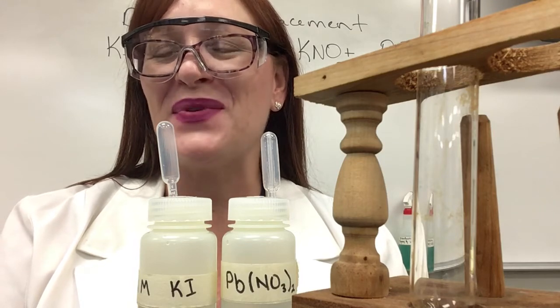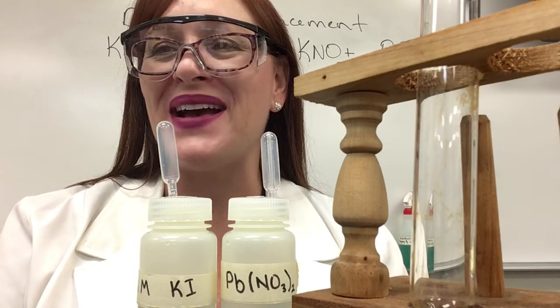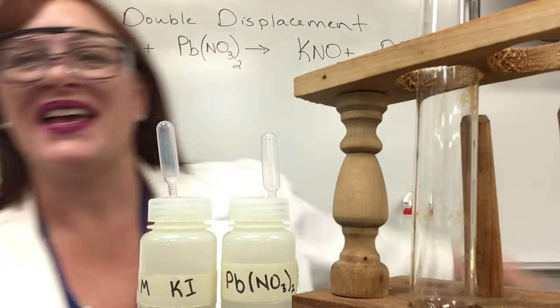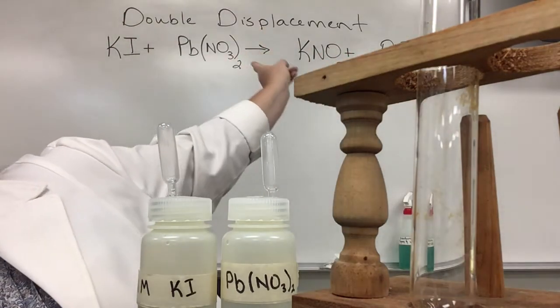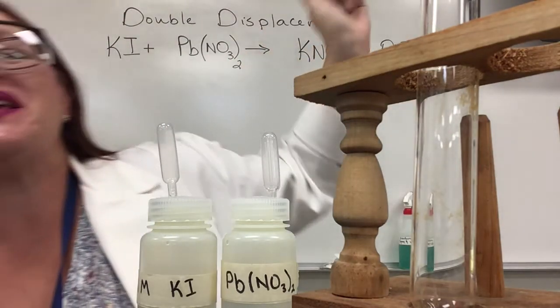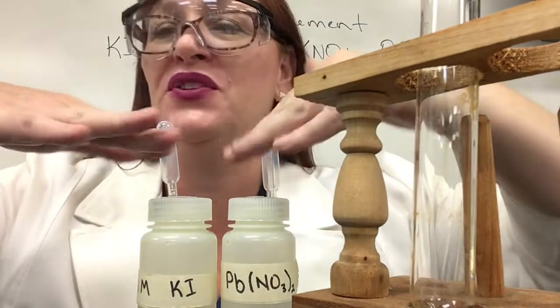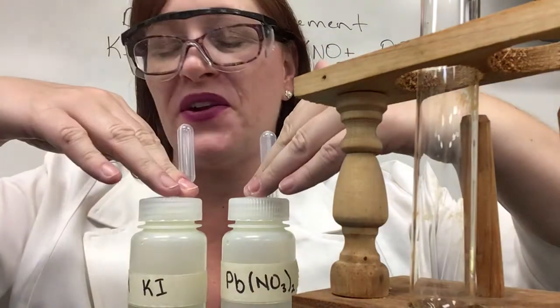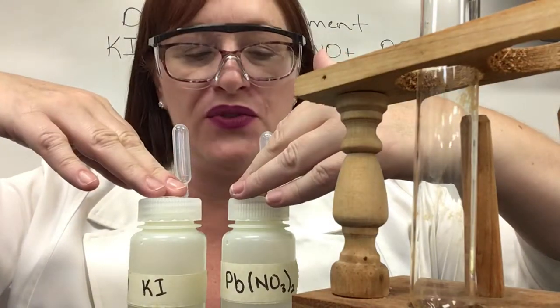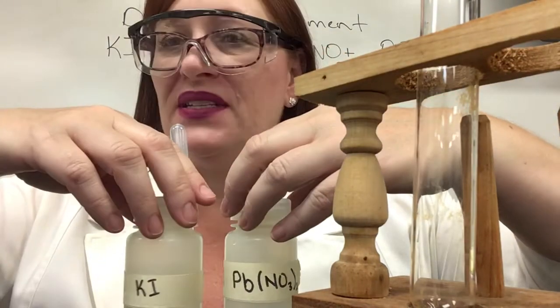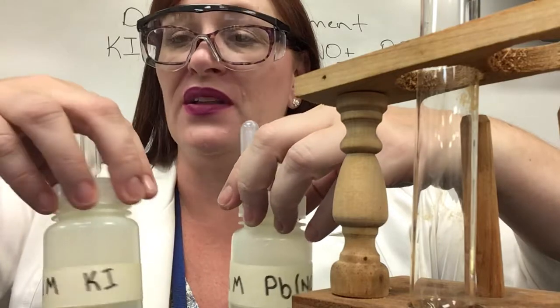Hi guys, Ms. Venable here bringing you a chemical reaction and today we are looking at double displacement. I have two reactants here and both of them are aqueous solutions and we're gonna take a look and see what they look like.